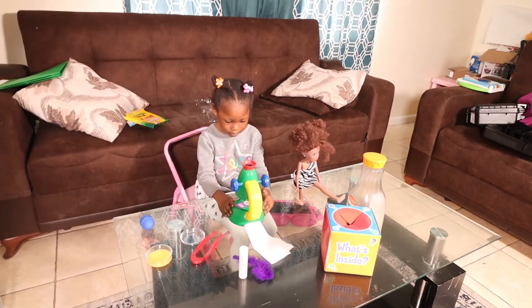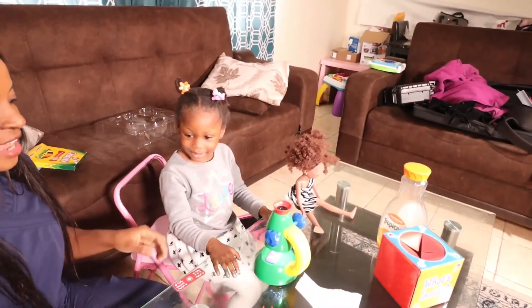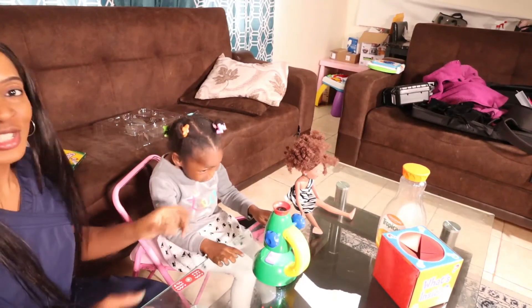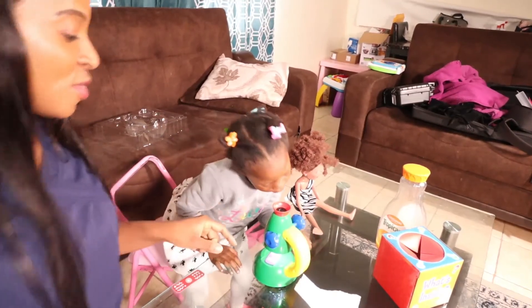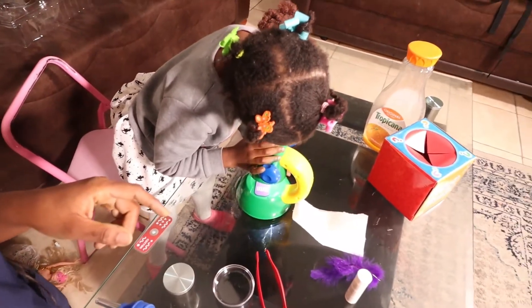Now we're trying to adjust the camera to see if I can give you guys a better view of what it's going to look like, so you can actually see better.